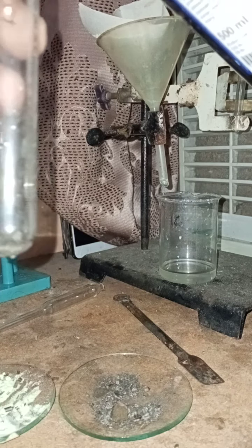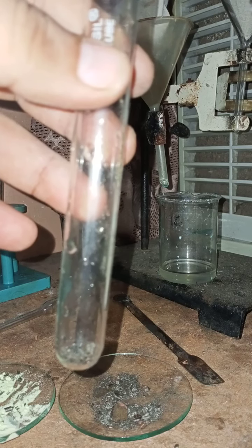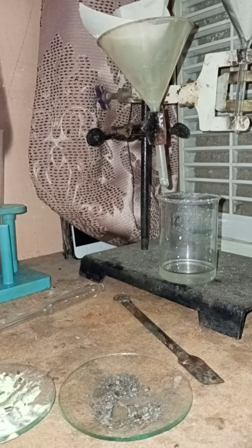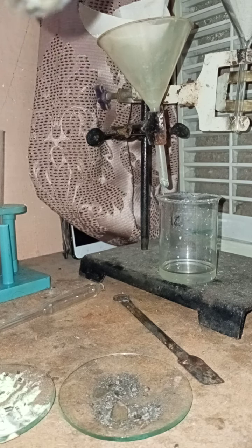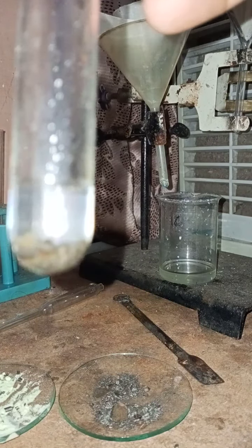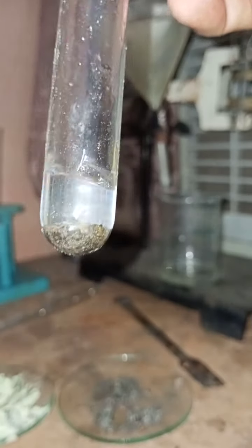Let us add this carbon disulfide to it, and what you can observe is that this newly formed substance does not dissolve in the carbon disulfide, and you can see that it is remaining at the bottom.